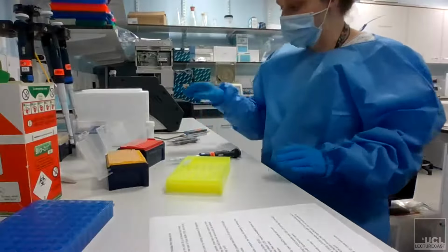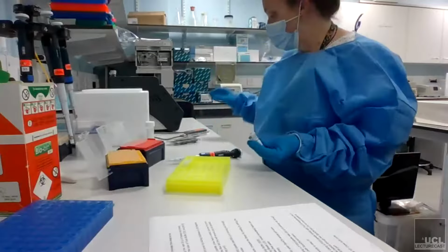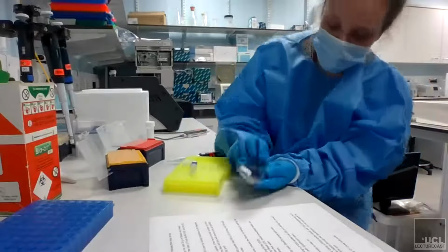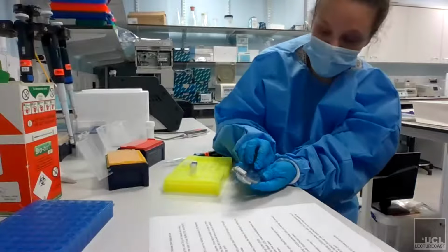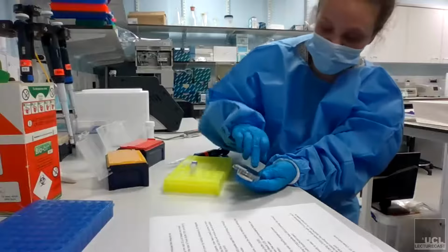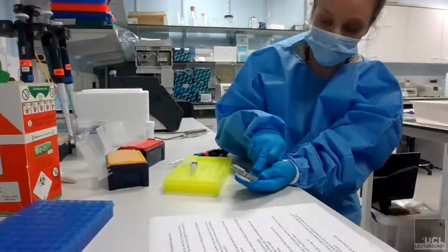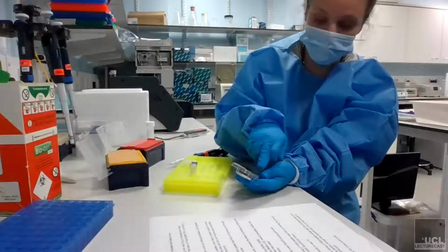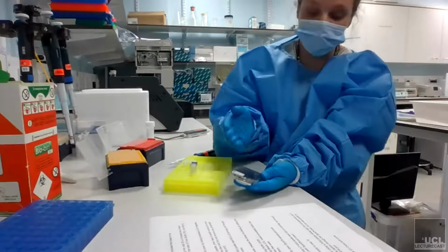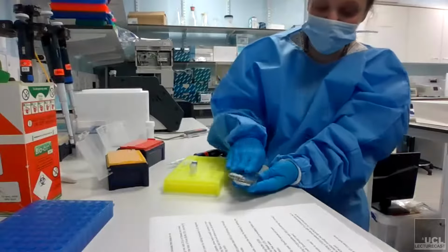So now what we're going to do, something we covered in that other video, is prepare the priming buffer. So this is the flow cell, and this is where the pores are. It's really a long, liquid-filled tube, that's all it is, and under here is where all the pores are. So this is the really important bit. When you buy them and they get delivered, it's filled with a yellow storage buffer, which enables it to maintain optimum pore safety, I guess. So that is stored in the fridge.